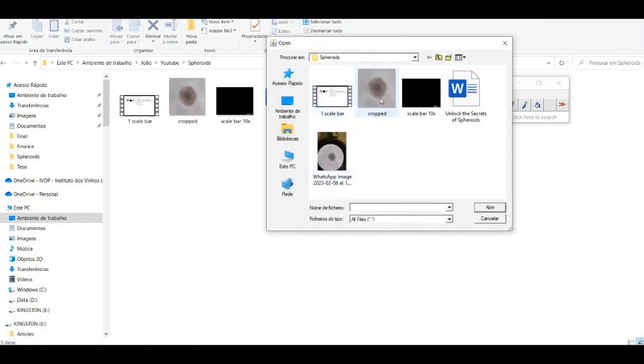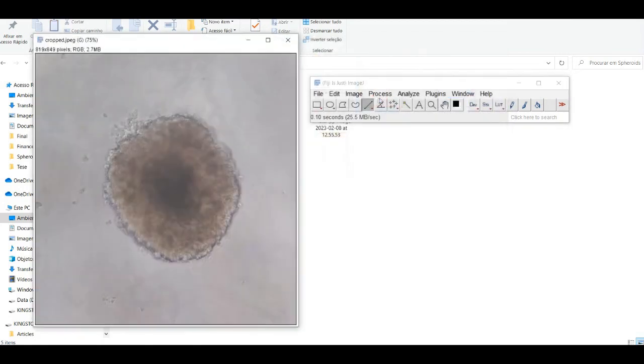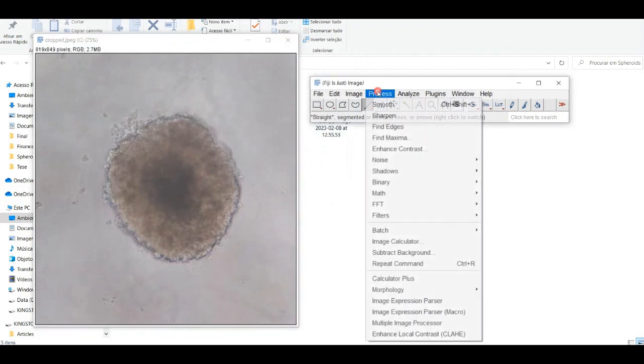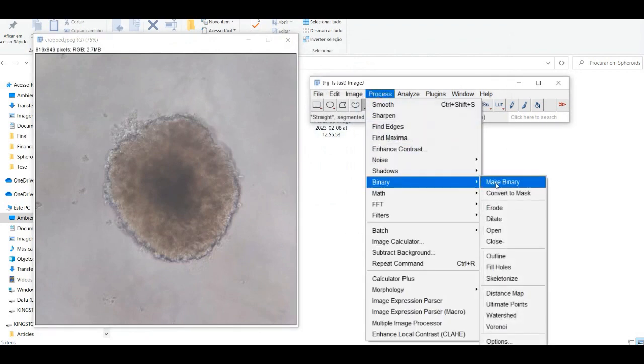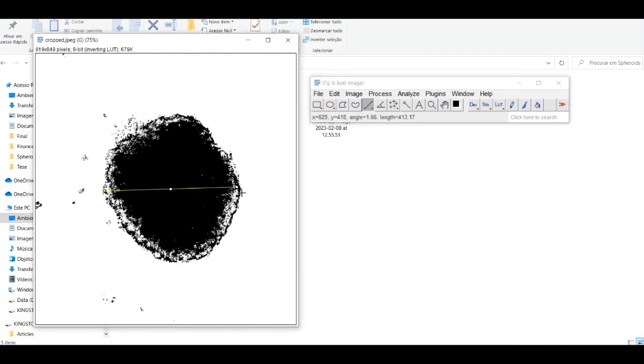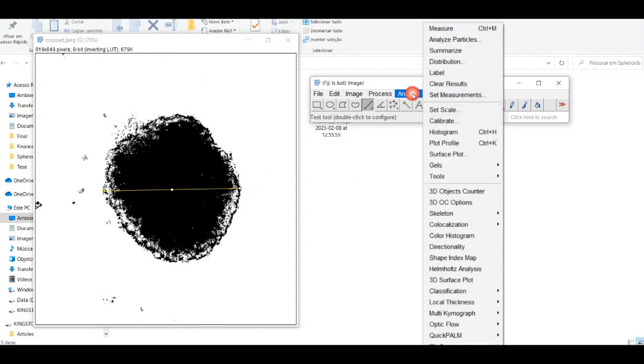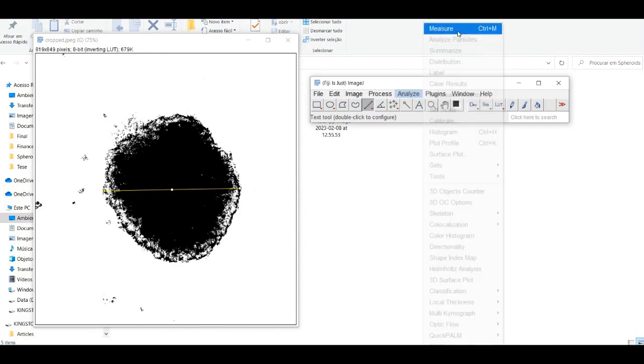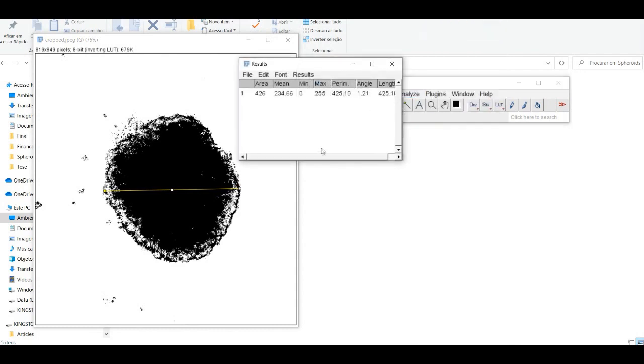To measure the diameter, open the spheroid image on ImageJ. Go to the ImageJ menu bar and select Process, then Binary and Make Binary. This will convert the images into a binary format, where the spheroid will be white and the background will be black.